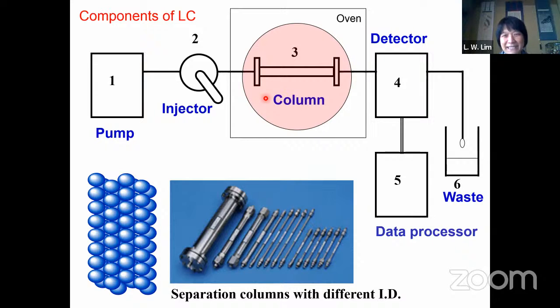It's like buying a PC. You don't have to worry about the memory, the motherboard, or the graphics card or whatever, because they come in a set. So the important thing you need to look at is the detector. Sometimes the detector and the software also will determine the price of your system.